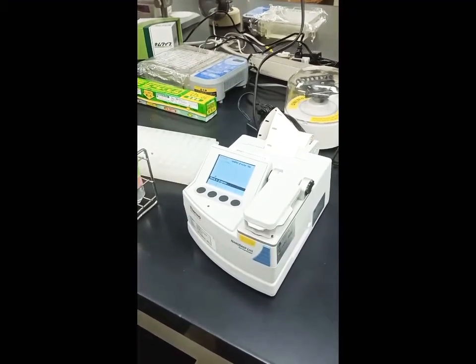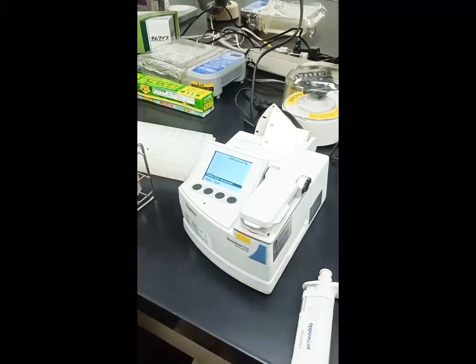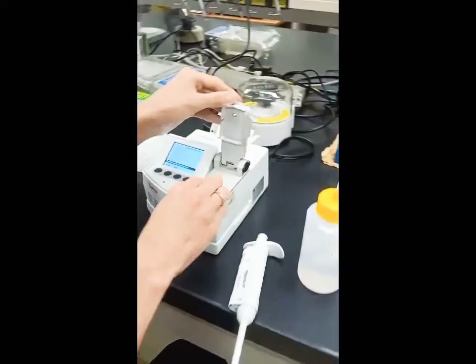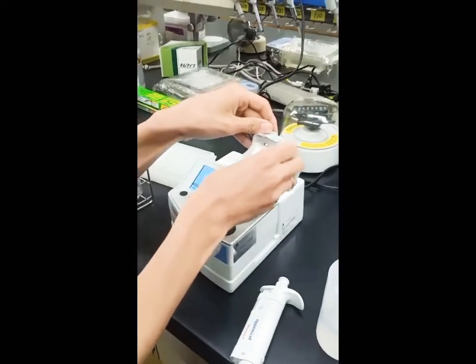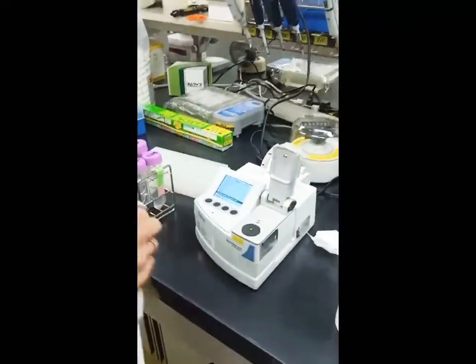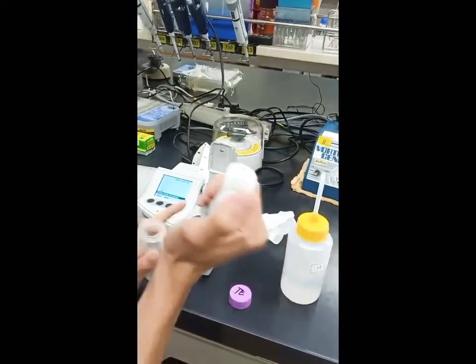It's calibrating — blank process. We should repeat this step two or three times, so we need to repeat the calibration two or three times.